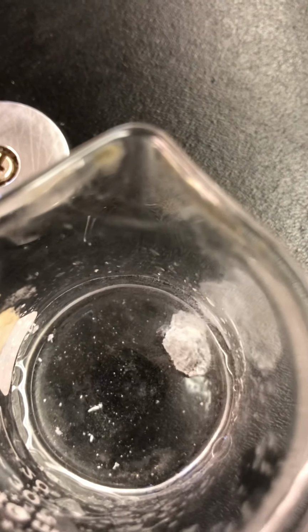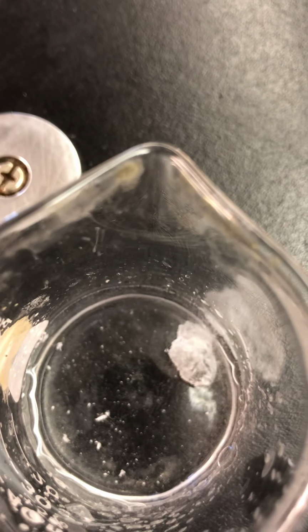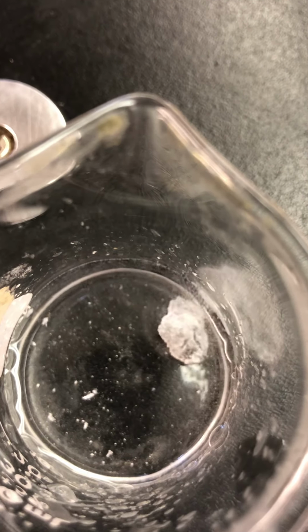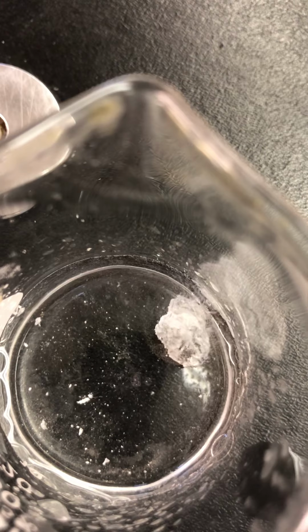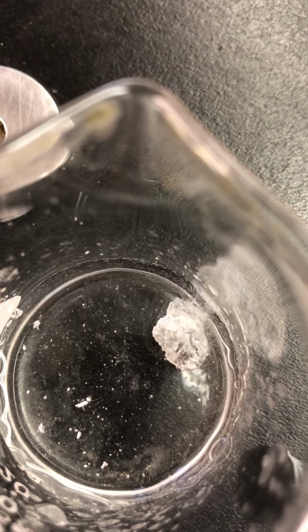Remember, I want you to make observations on whether it's soluble or insoluble. But in this case here, this one's kind of a special situation. So you don't have to comment on soluble or insoluble for solid number 5, but you should be writing down what you see happening to the solid when the water was added.